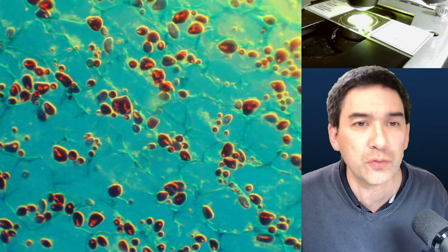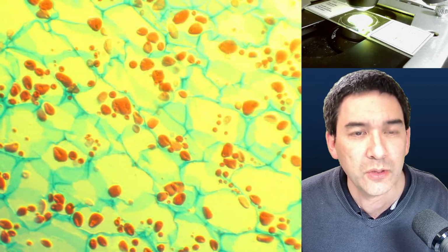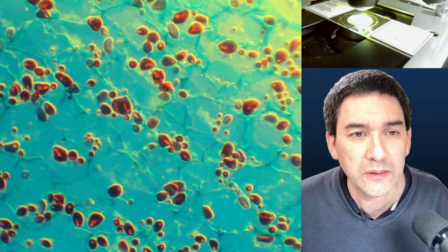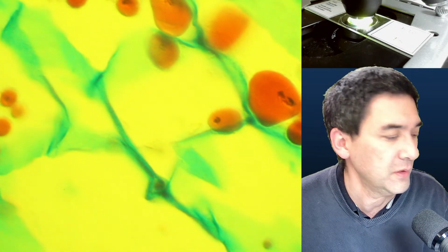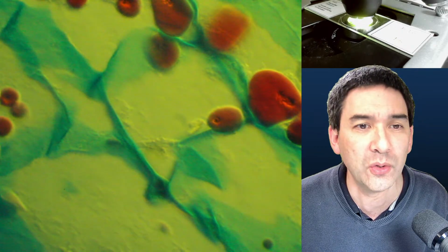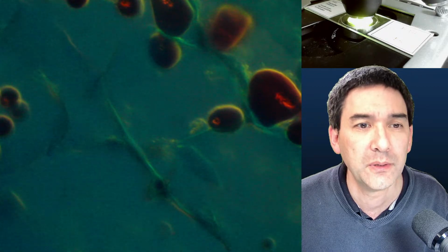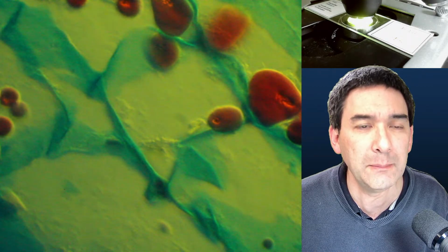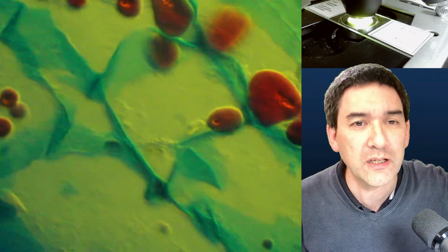These are again the starch grains, and in case you were not here in last week's live stream, if I swing out the filter holder a little bit, maybe at a higher magnification, you might see that it does appear to cast a shadow. It becomes darker as well, but it looks almost a little bit three-dimensional. So this is a combination of Rheinberg and oblique illumination, actually.